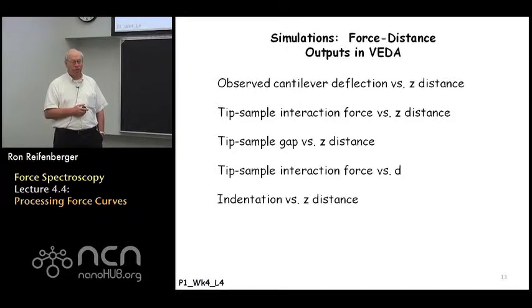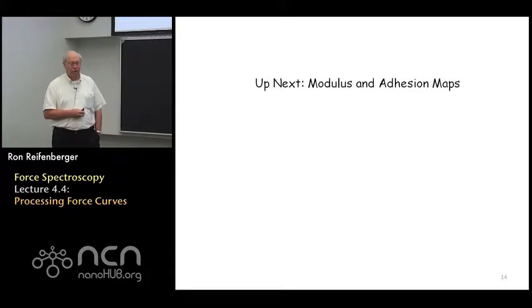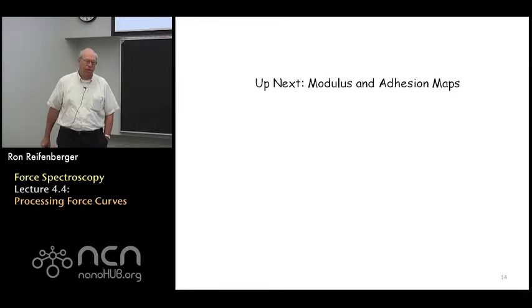This is more of a preview of what's coming, and I'll just end, sorry I ran over a couple of minutes on this lecture, by saying that in the next lecture we're going to discuss how to do modulus and adhesion maps by doing force versus displacement curves at different points on a sample. This will then allow us to map out in a systematic way whether the modulus of the sample varies with position, and also whether the adhesion of the tip to the substrate varies with position. So we'll discuss that in the next lecture.